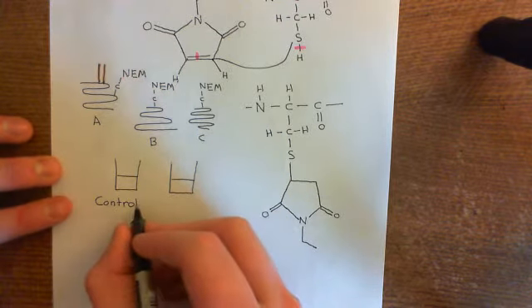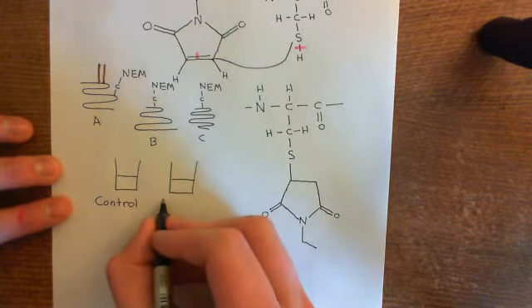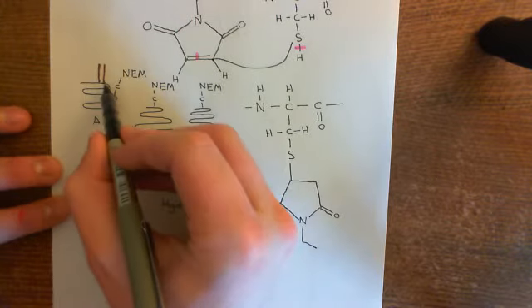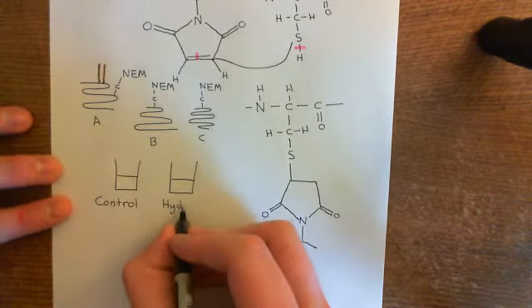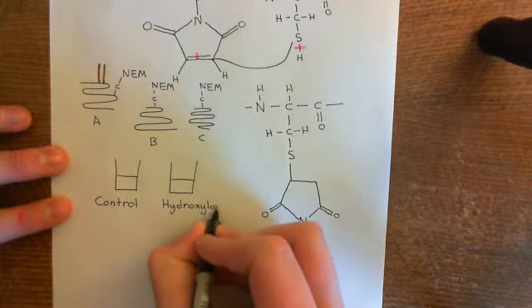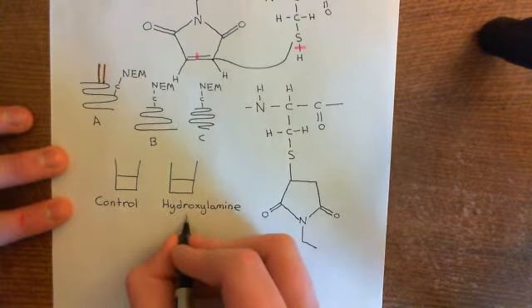So the control, we're going to do nothing in this next step. And to the other one, what we're going to now add in is a molecule which will break off the palmitoyl groups from the cysteine residues. This is a molecule known as hydroxylamine. So let me show you the structure of hydroxylamine.